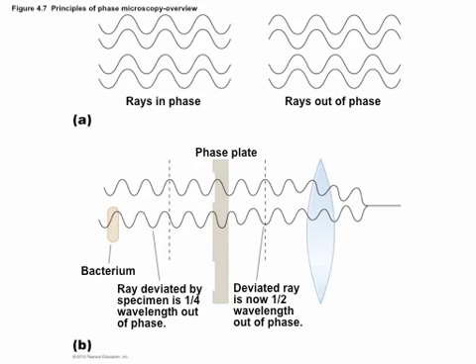So this is the peak of this one, and it lines up with not quite the peak of that one. When it moves through what's called the phase plate, that difference is going to be magnified. So that now, actually, the differences are opposite. When one goes up, the other goes down. And that means that these two light waves are going to be very easy to distinguish from one another, and that's going to increase the contrast of what you're looking at without staining it.